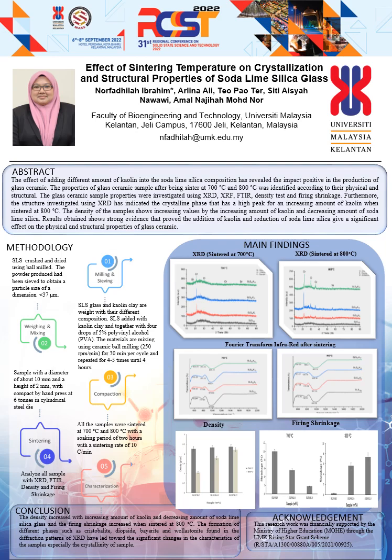And then for FTIR, that's different. We measured before and after, but here we present the results after the sintering process. The difference for 700 is that the graph shifts.